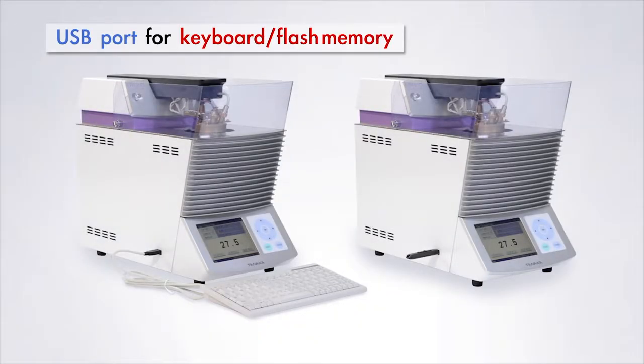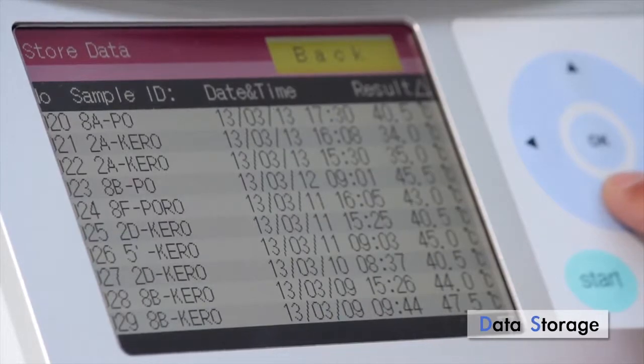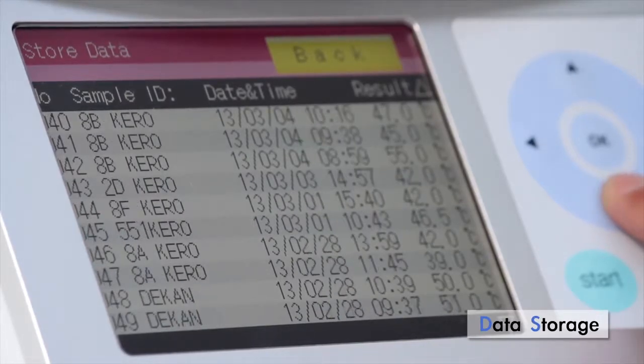The USB port is connectable with an external keyboard or a flash memory. Test results can be temporarily stored in the instrument. In addition, a flash memory can be used for permanent storage.